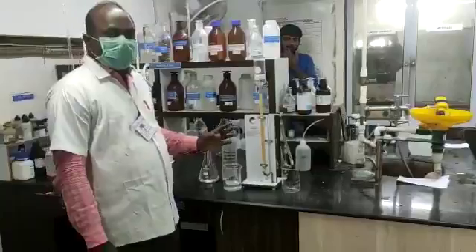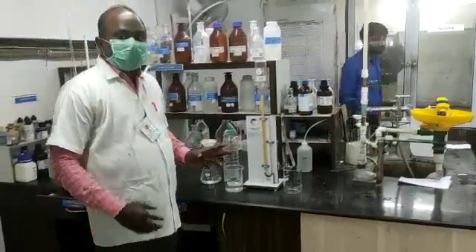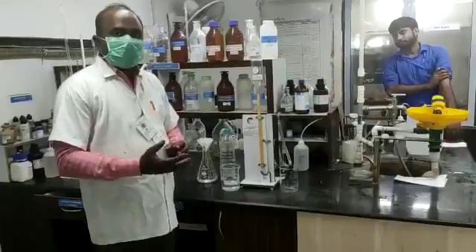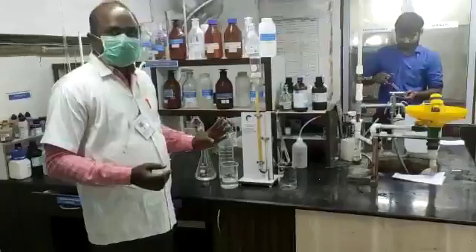Before you conduct the Sulphate test, you have to remove the turbidity and remove the iron content. This is done using the ion exchange test method.